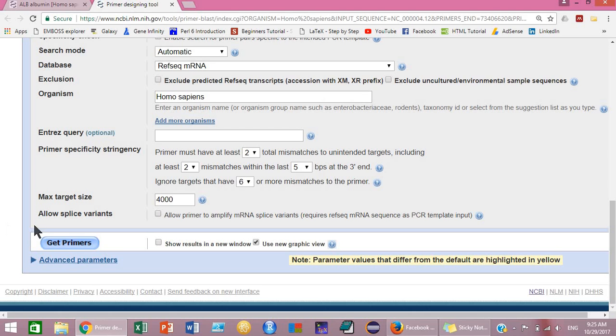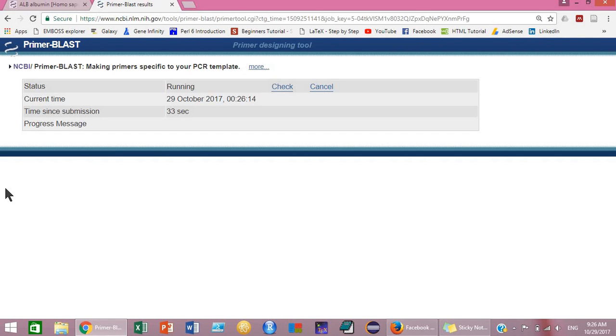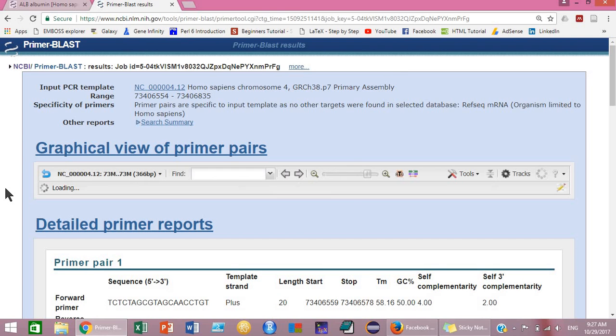Then this page will be opened. In this page, at the end of this page, click on 'Get Primers' and your primers will be ready in a couple of seconds.